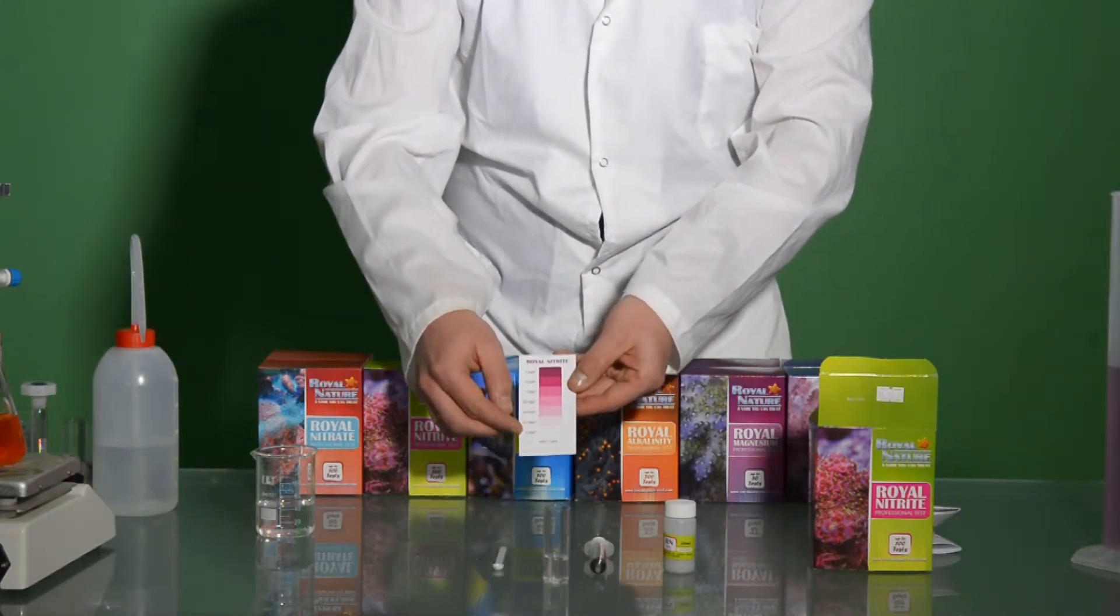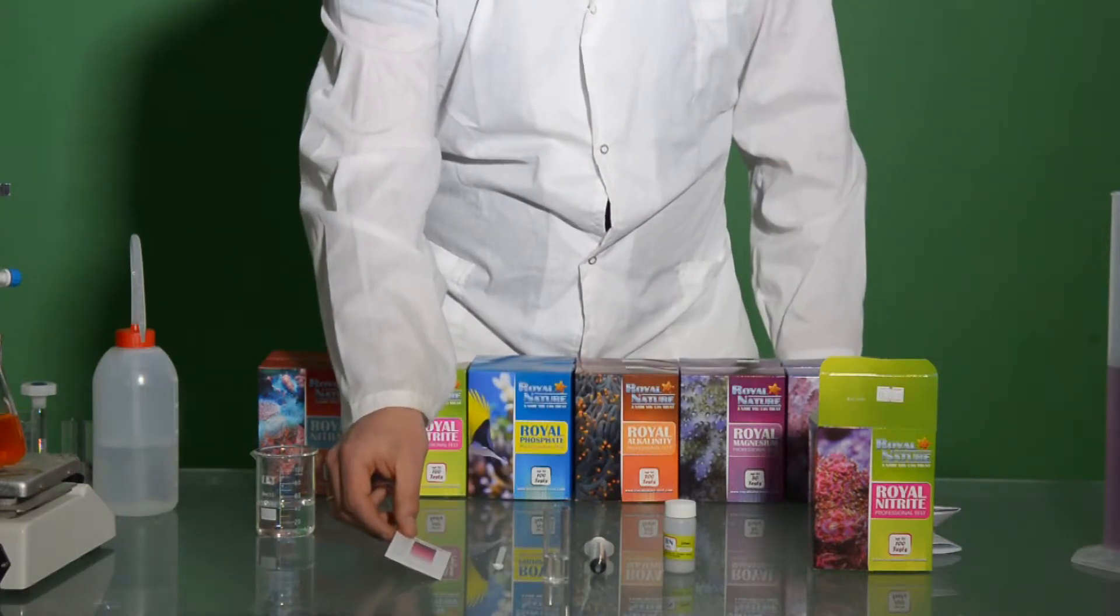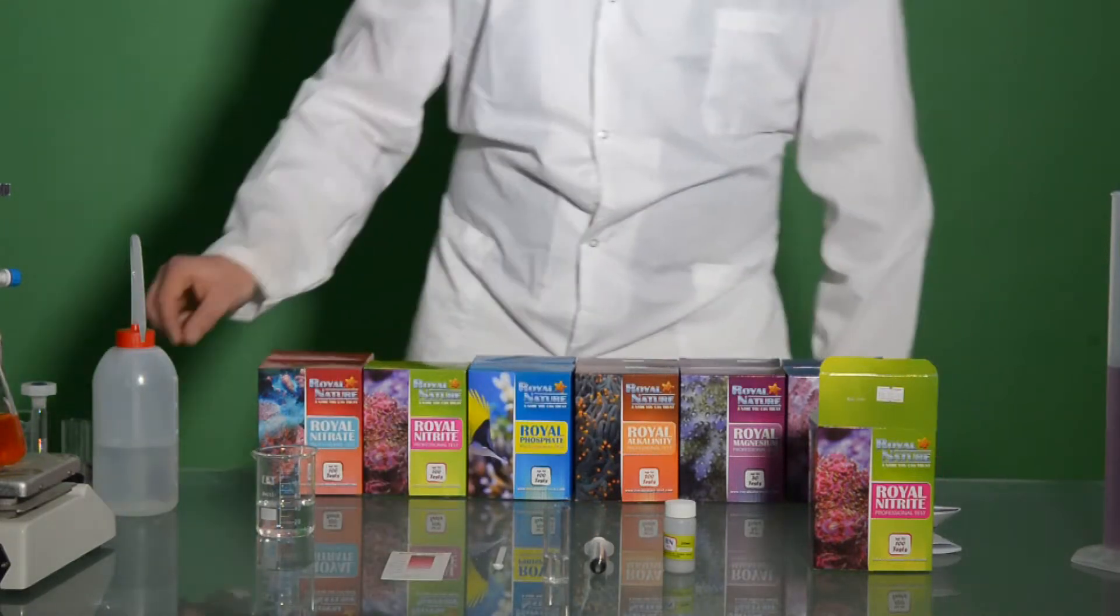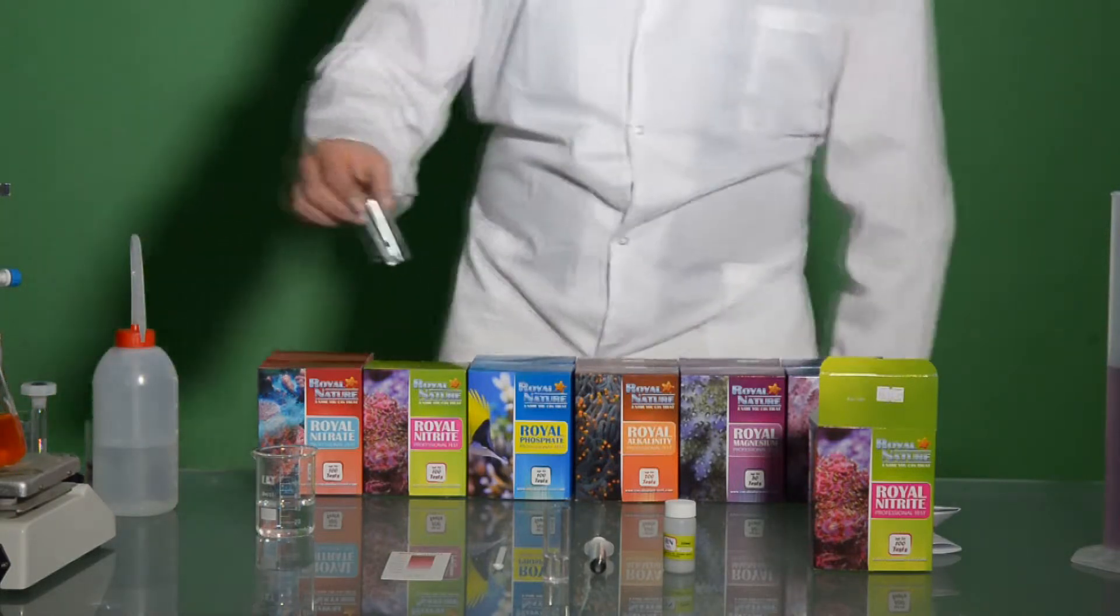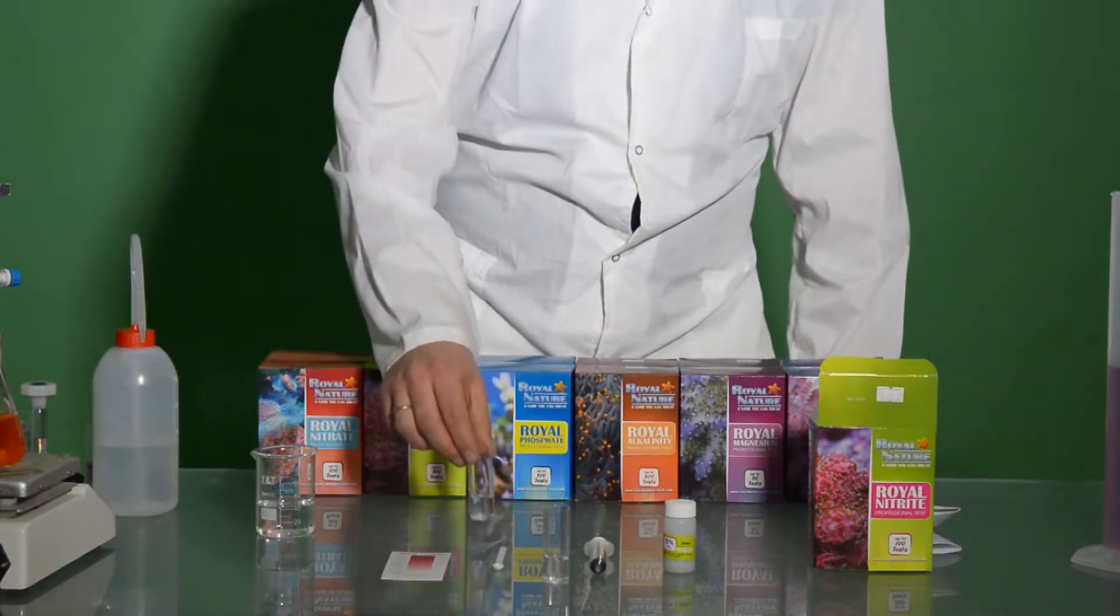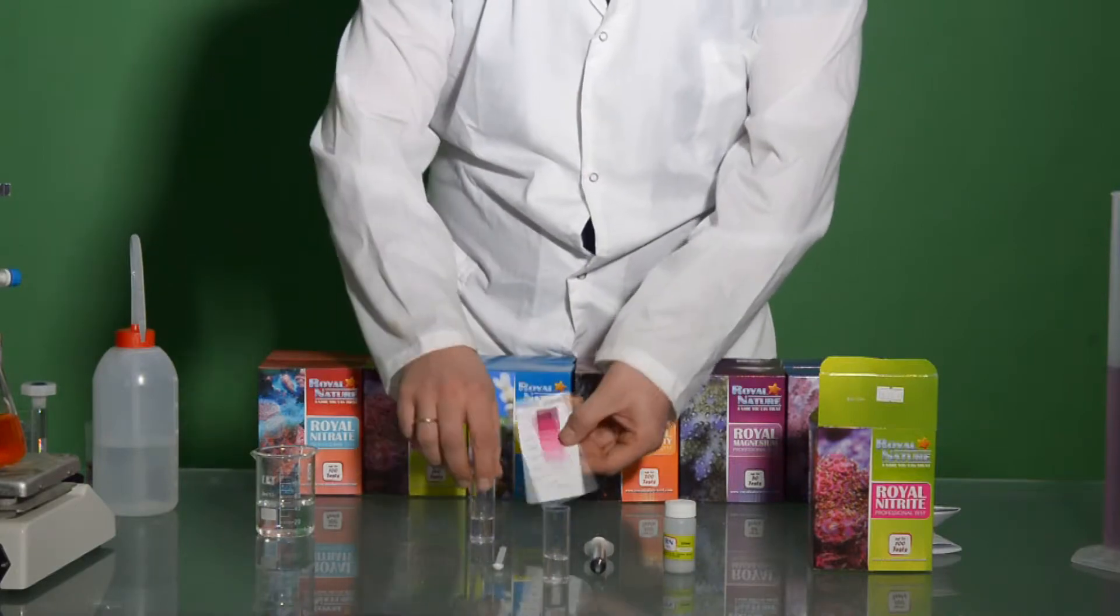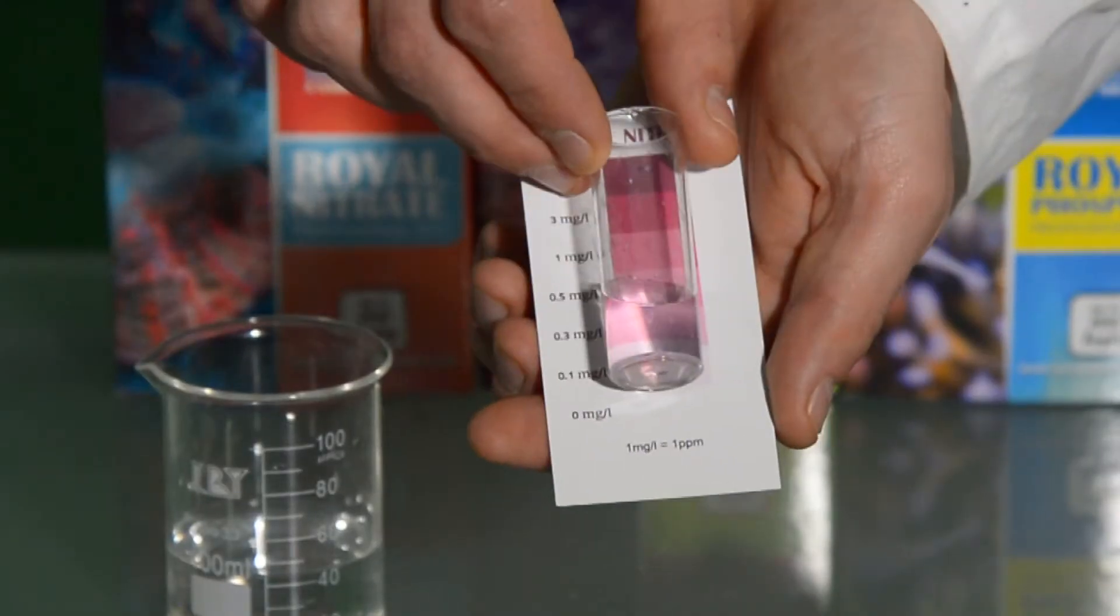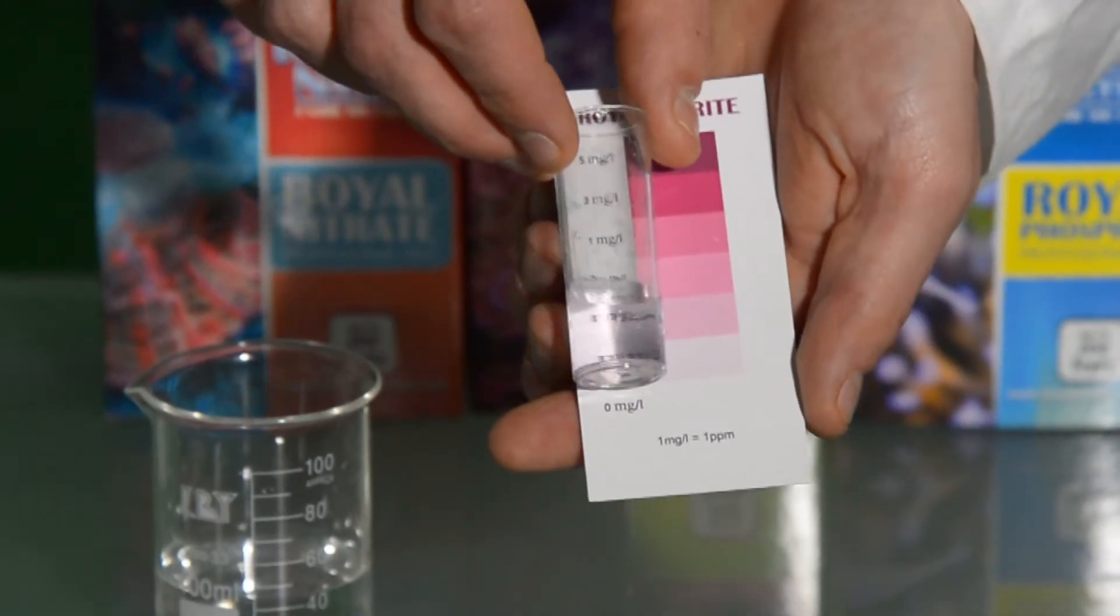In order to show you what the different colors are, we prepared in our lab more solutions with different levels of nitrites. The first one would be 0.1ppm and we can see the color next to the chart.